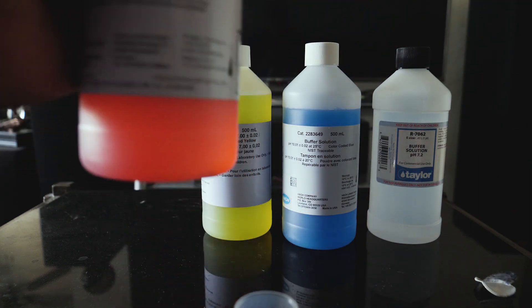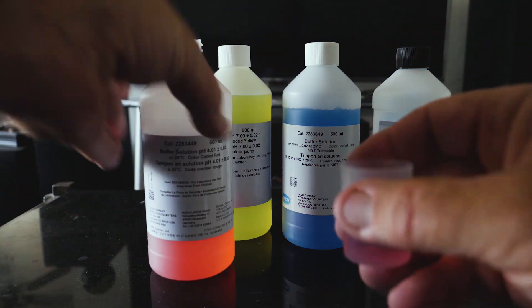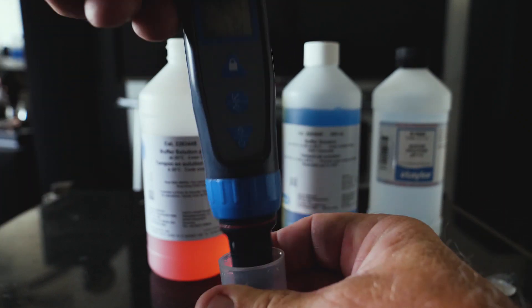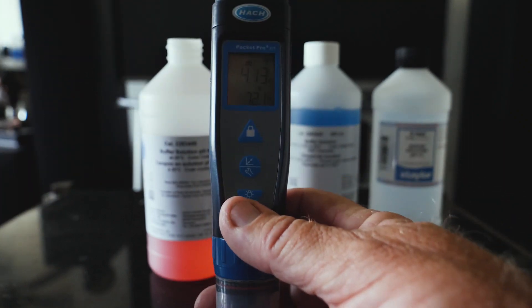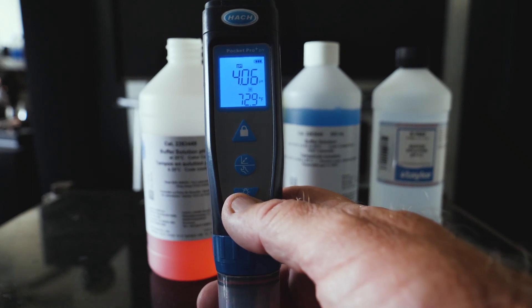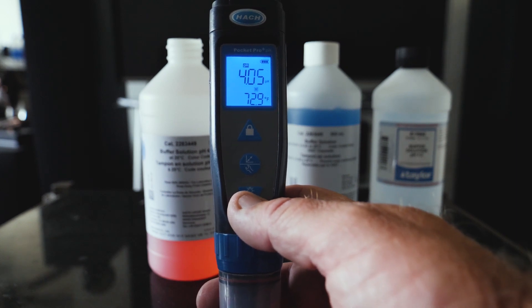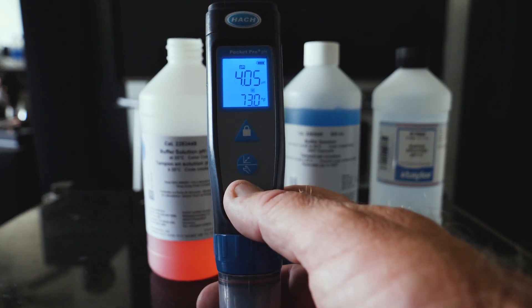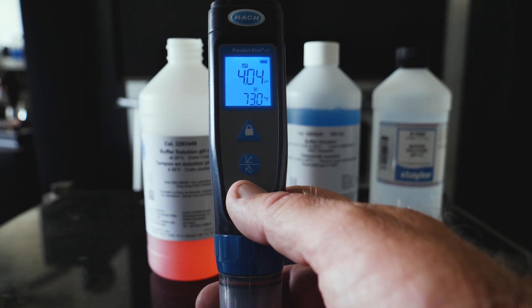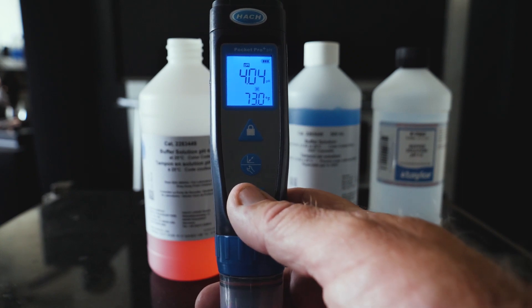Now let's go to 4.0. Let's see what we got here at 4.0. We got 4.05, 4.04. That's extremely accurate.